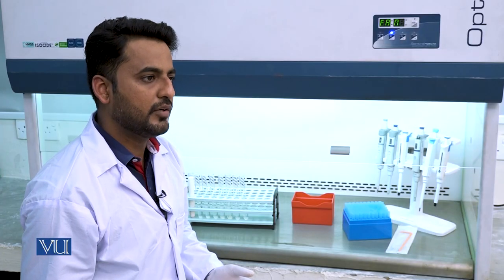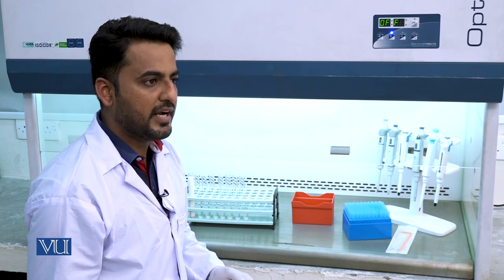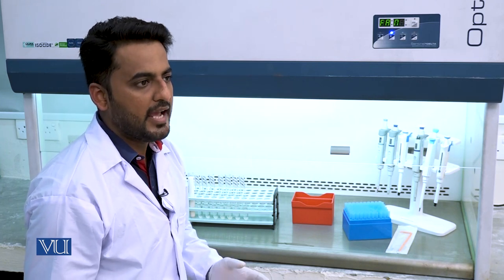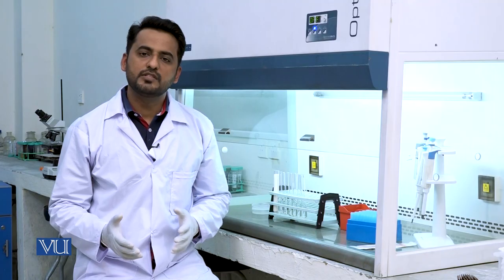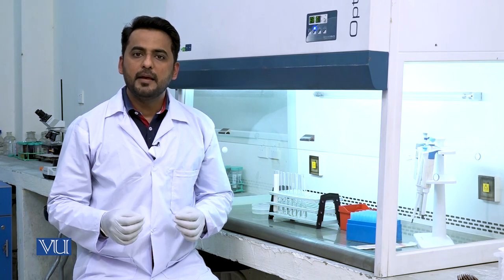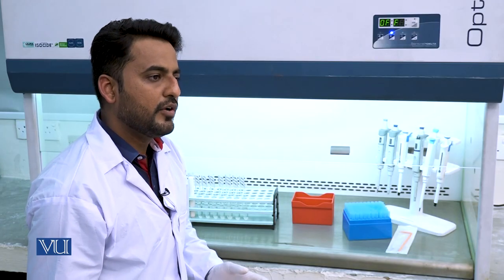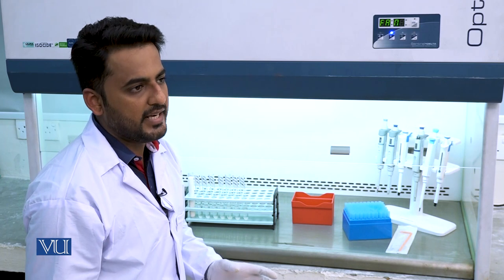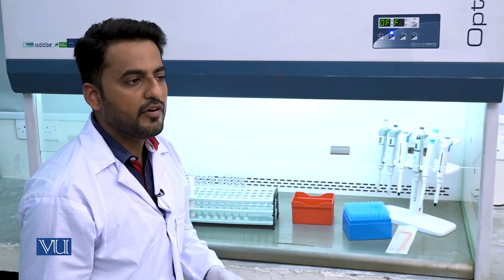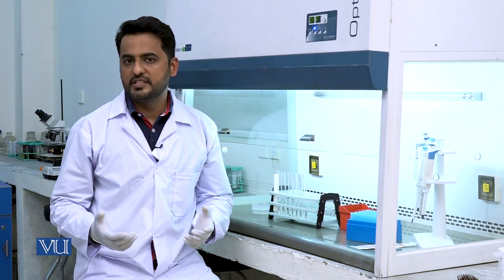After making this serial dilution, we will take 1 ml of solution from the last test tube and spread it over the already prepared MRS agar plates. Once we pour 1 ml of solution on the MRS plates, with the help of the L-shaped spreader, we will spread that solution. After spreading, we will simply incubate these plates at 37 degrees centigrade for 24 hours in order to get the growth of Lactobacillus species. So let's begin with this experiment.